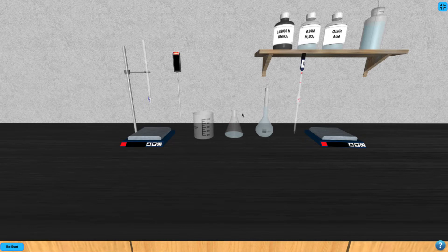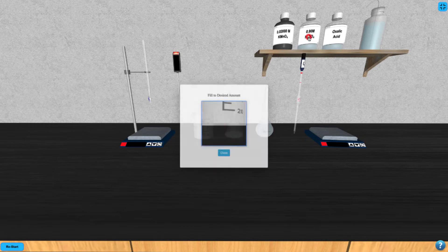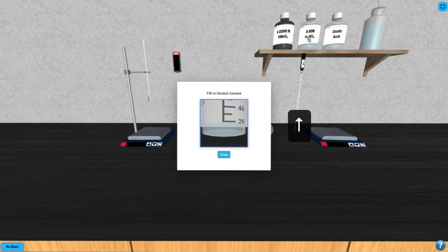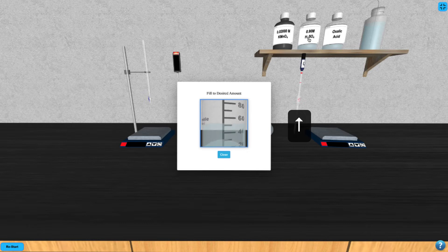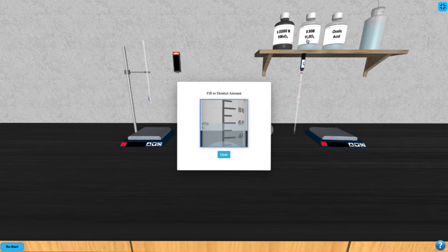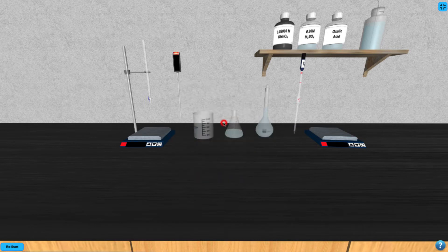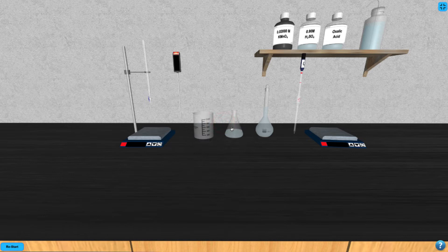Next, click on the H2SO4 bottle and add 60 milliliters to the 100 milliliter beaker. Use your up arrow to add the appropriate amount of sulfuric acid to the beaker. Then click on the beaker to add the H2SO4 to the Erlenmeyer.